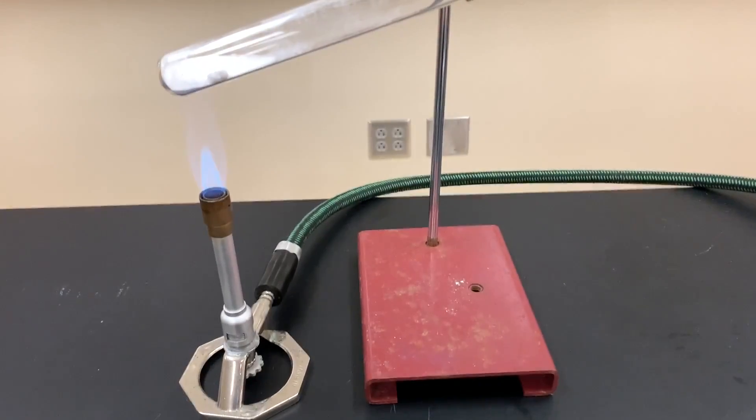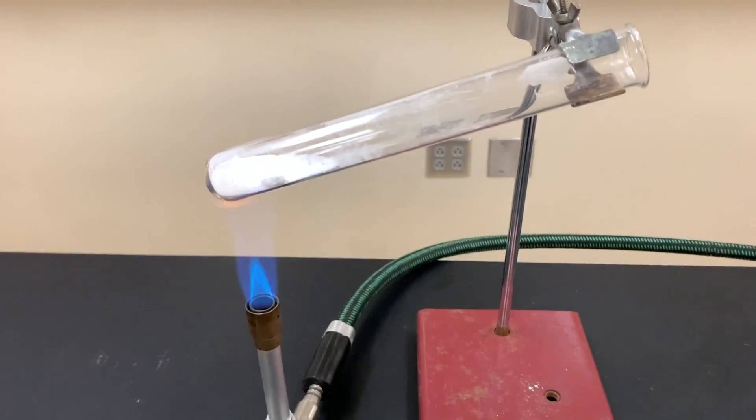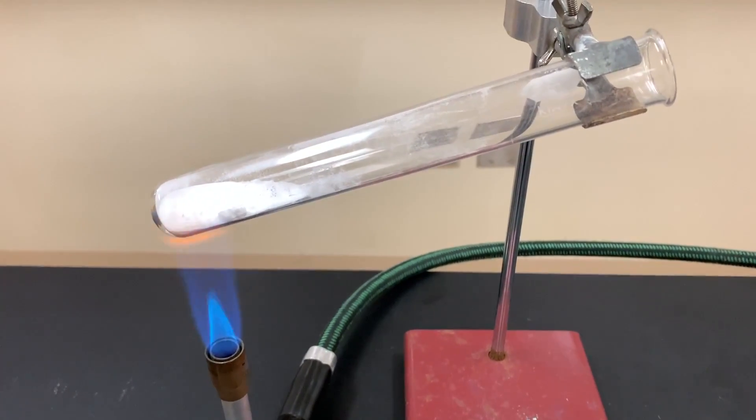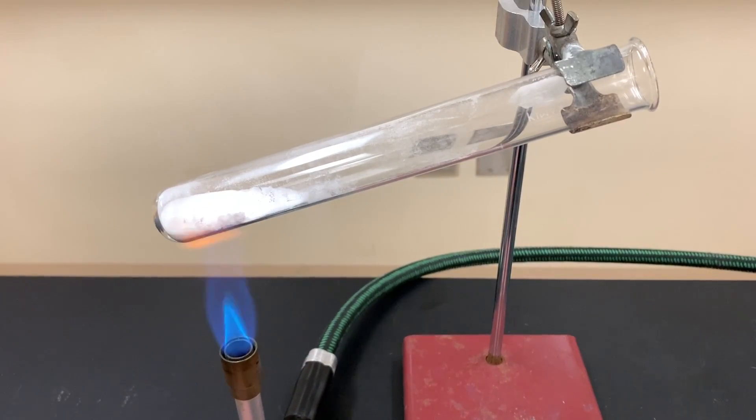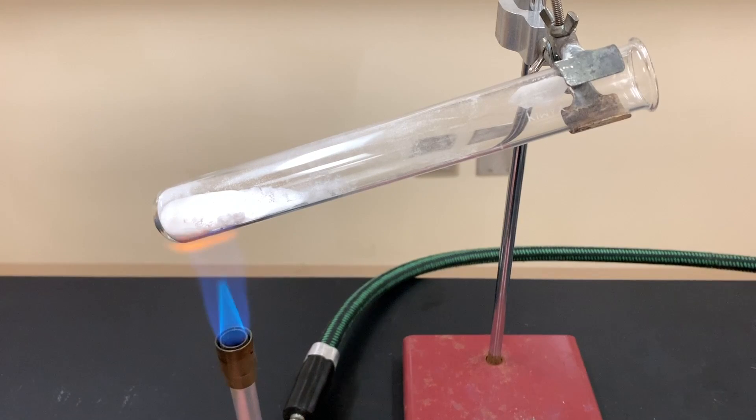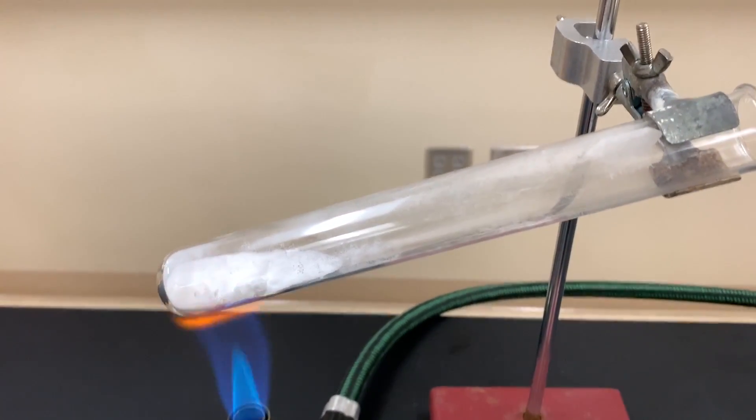I'm going to move this up so that we can actually see the test tube and move it a little bit closer because we're looking for evidence of those three products. When sodium bicarbonate decomposes you do not get a color change so it's going to make this a little more complicated. So I'm going to try to get as close as I can to the chemical change so that you can see what's going on in that test tube.